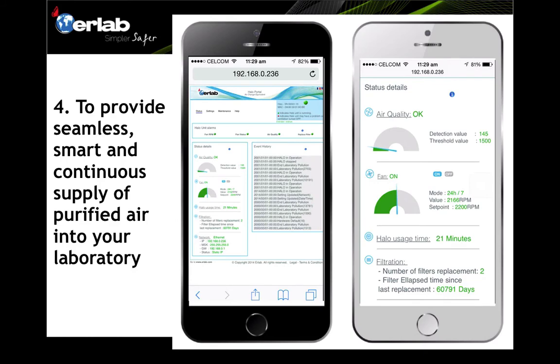Number four — to provide seamless, smart, and continuous supply of purified air into your laboratory. Each Halo system comes with software you can use to monitor room air quality via smartphone or laptop. The software interface provides information about air quality, threshold levels, current air quality readings, fan speed and runtime, Halo usage time, how long it has been implemented, filter condition, and when it is time to change the filters. All events are recorded in the software.